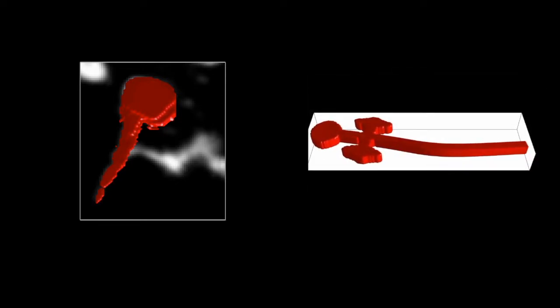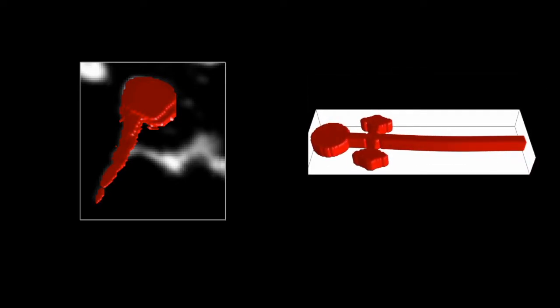However, the conventional registration method is not suitable for this problem because it cannot handle severe changes in appearance and the mapping function is arbitrary. On the other hand, we tackle this problem as the partwise segmentation with artificial template. This template is independent from spatial resolutions with predetermined compartments. The partition is generated according to specific context derived from the domain knowledge. Then, we align images by segmenting them accordingly to the template.